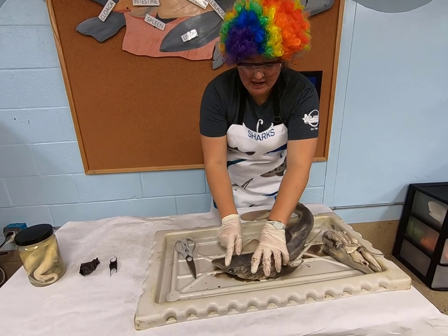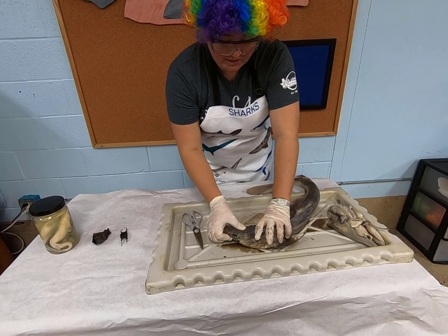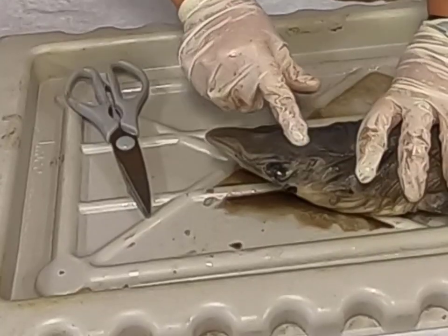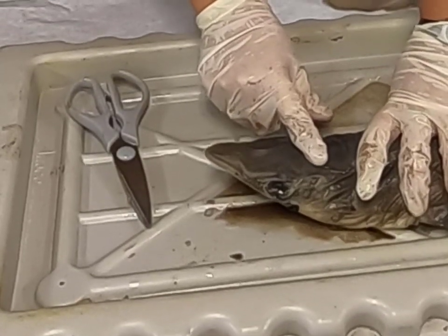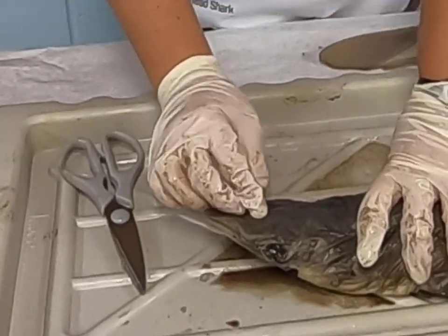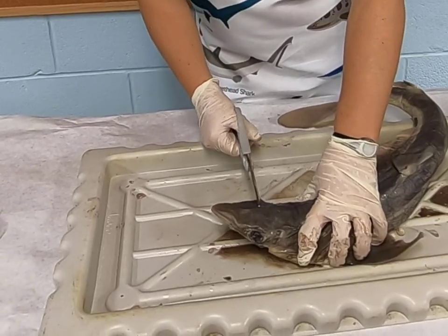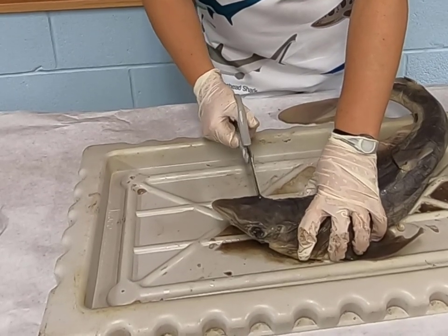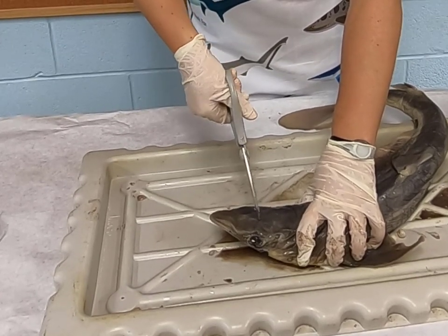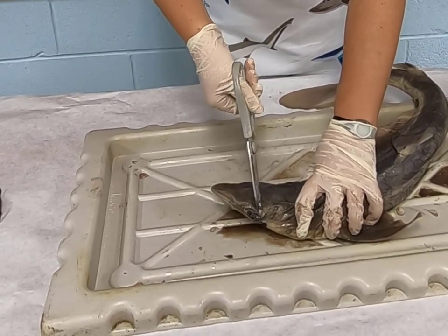So the shark's brain is located, I can kind of see, it's right in here. And you can kind of feel where the cartilage is on the shark's skull, and kind of see where it feels. So I feel right here, it seems where the brain is. So what we do is we cut from eye socket to eye socket, and then we become ninjas, and I'll explain that in a second. So you can hear me cut through. This is all cartilage, and we gotta be really shallow because we don't wanna get that brain. Now, since I kind of have an idea where it is, I'll cut a little bit more.